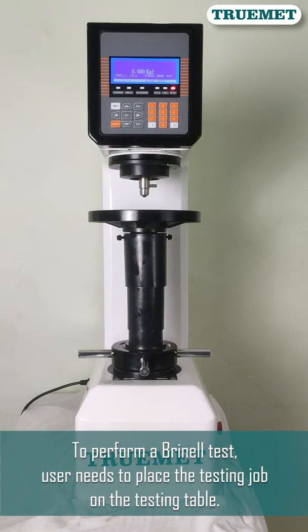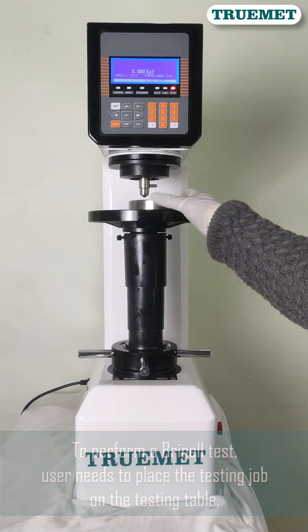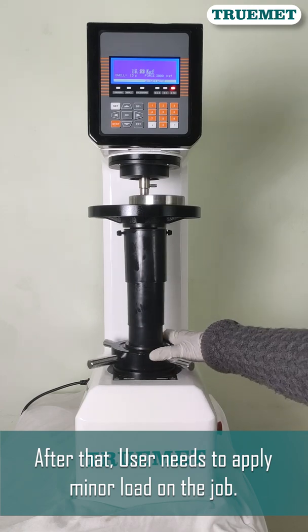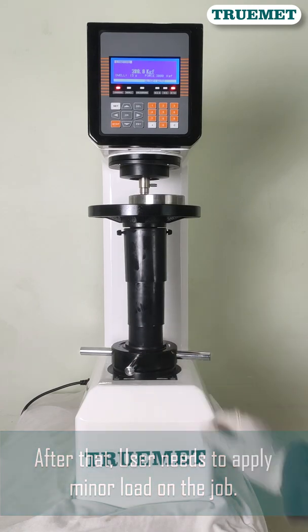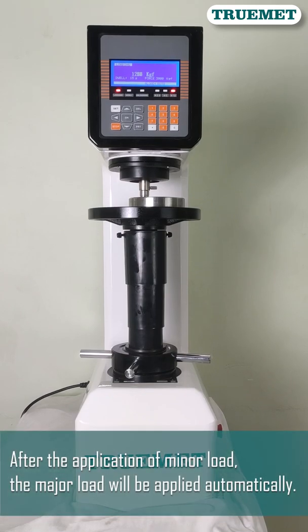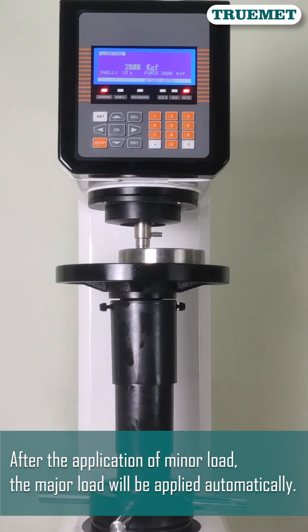To perform a Brinell test, the user needs to place the testing job on the testing table. After that, a minor load is applied on the job. After the application of the minor load, the major load will be applied automatically.